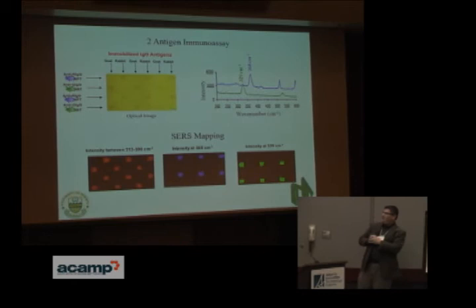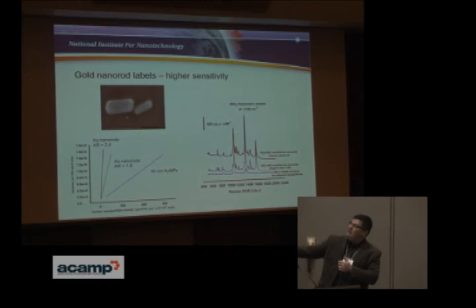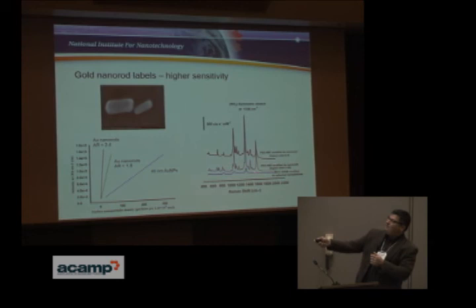And the last slide that I'll show you is some recent work that we've been doing with different shapes of particles. And the theory predicts that various shapes will give you more intense Raman signals. And so what we've been working on recently are gold nano rods. And so in this case, we have a rod that's about 30 nanometers wide and about 60, 65 nanometers long. And so they're not the spherical nanoparticles. No, they're longer.